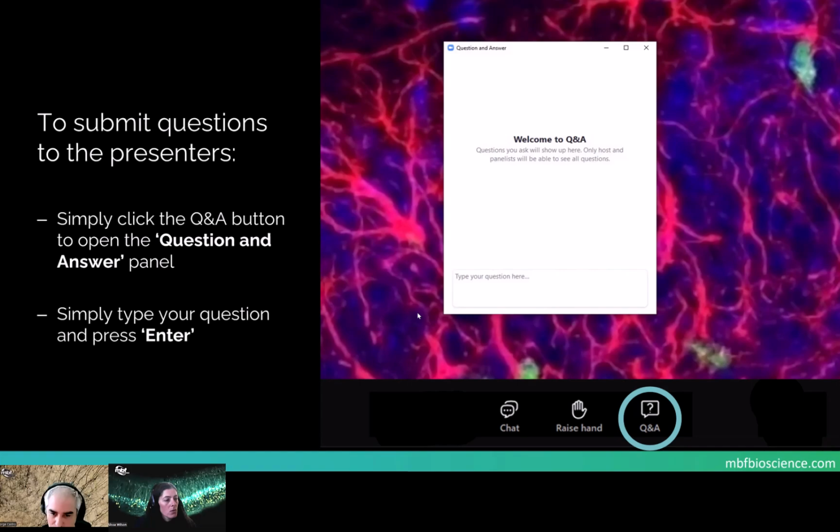There's one about stereology software. So yes, currently Stereo Investigator AI is standalone software. But if you already have Stereo Investigator, please contact us because we definitely want to work with you to be able to integrate Stereo AI into your workflow.